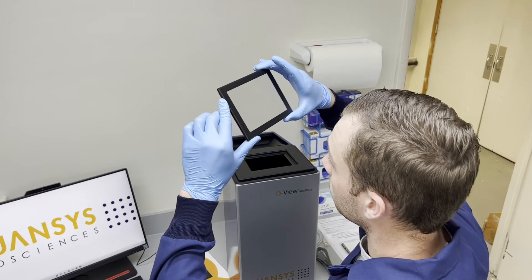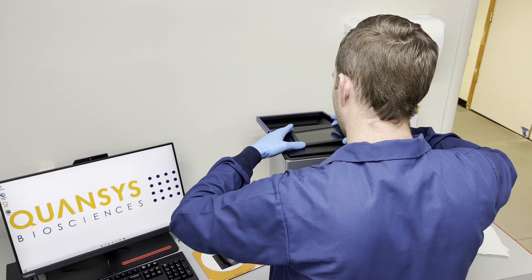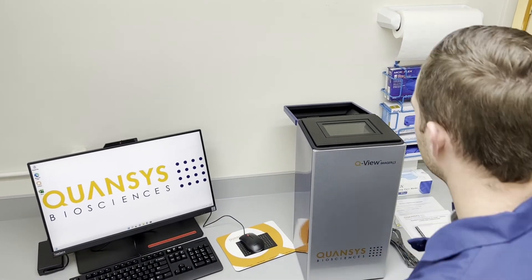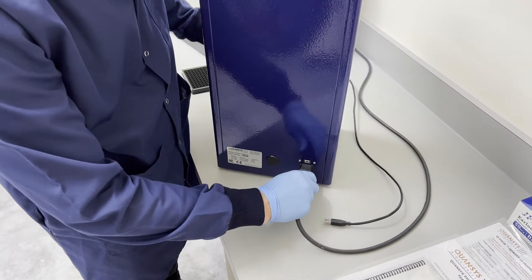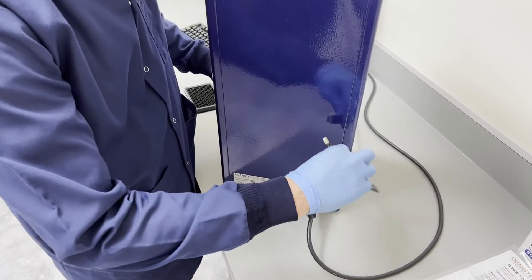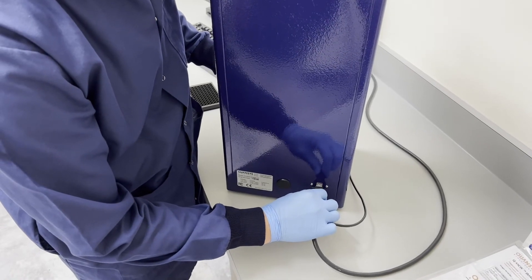Carefully set the glass insert over the imager aperture. On the back of the imager, find the ports for the power and USB cables. Plug the power cord into the imager and an electrical outlet, then plug the USB cable into the imager and a computer.